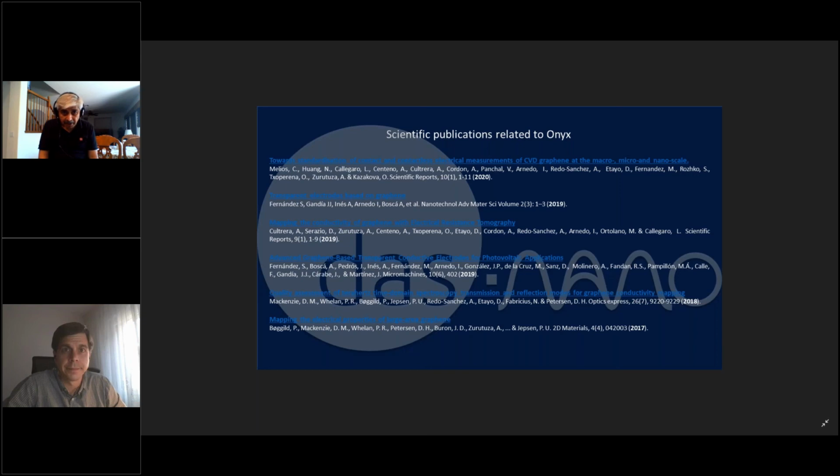Okay, thank you. Are there any special safety considerations when dealing with terahertz radiation, which users should be aware of? No, the power that is emitted by the equipment is very, very low, and there is no risk for the health. No problem at all.